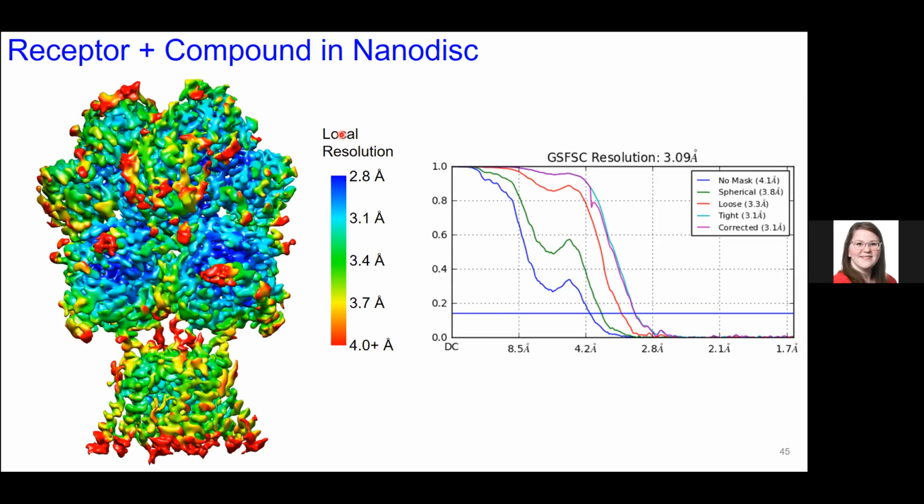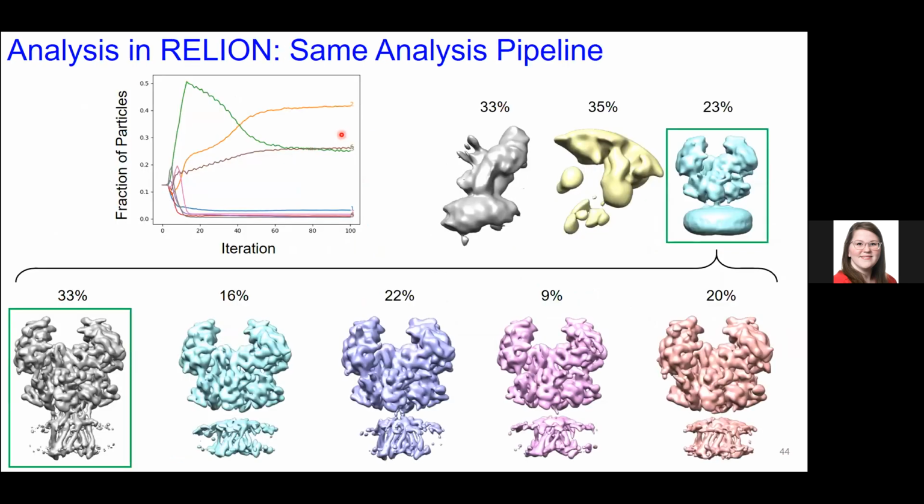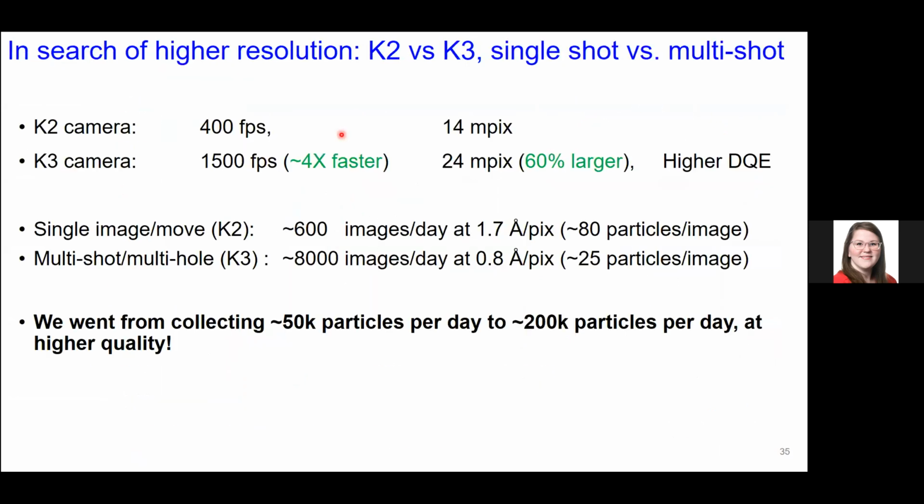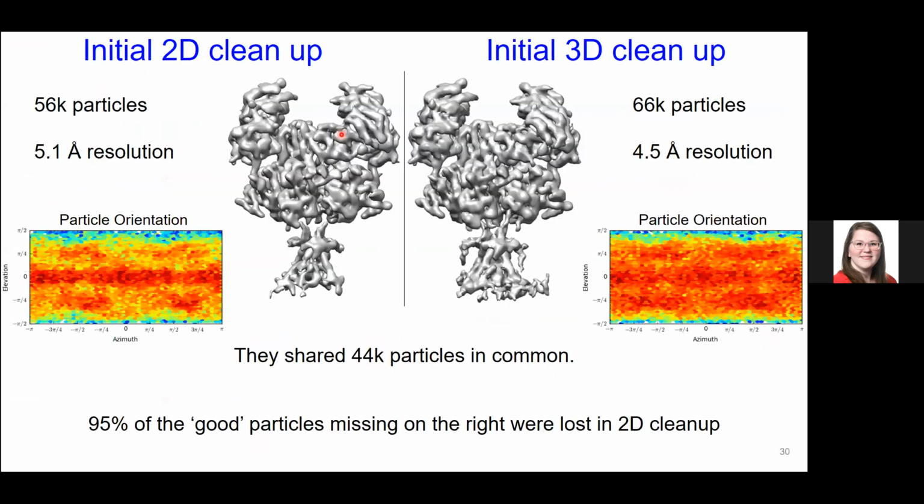Great. And then the next question is, when tracking back the unique 22K particles that were lost during 2D classification, did you run 2D on those unique 22K and see if the classes looked unique? Or did they look like something that you would throw away?